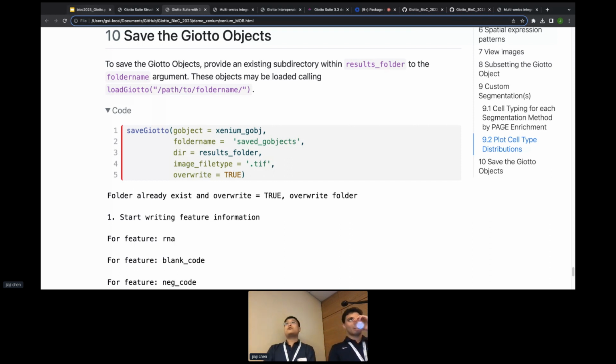Yeah, we also had a lot of issues with that particular data set, and it was very hard to even put that into memory. And you can't really deal with it even on servers because of how big it usually is. But we are currently working on another package to deal with this kind of scalability in the form of a database. Basically, we would transcode that into a DuckDB database, and then we would be able to pull specific spatial queries from there. That's our overall plan for how we would deal with this kind of thing.